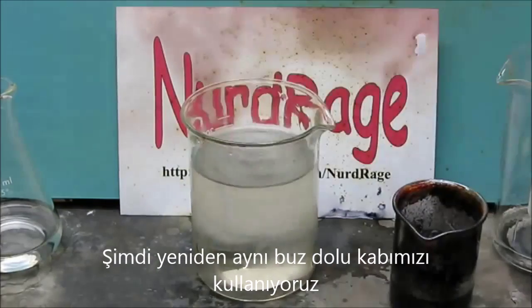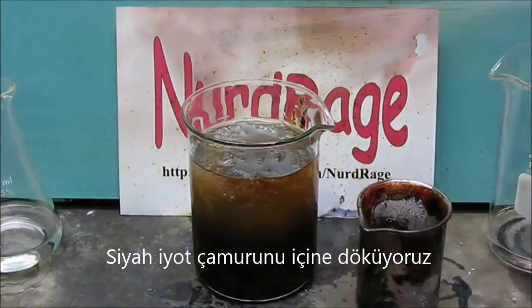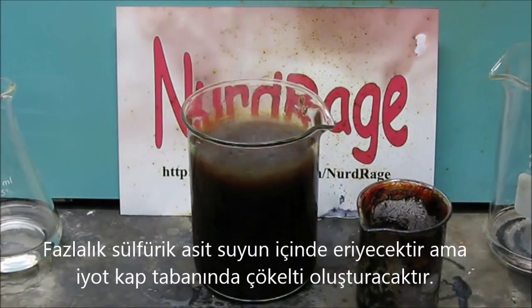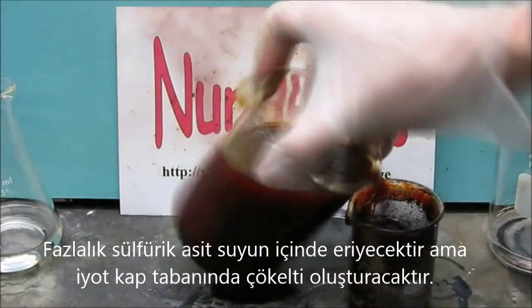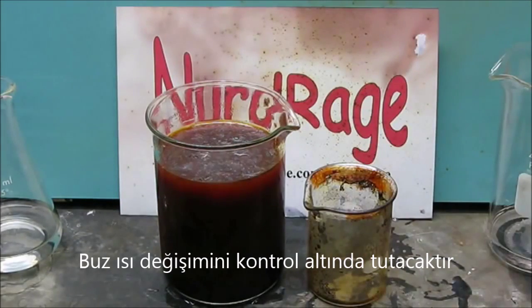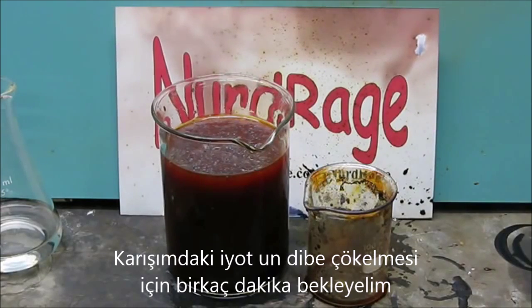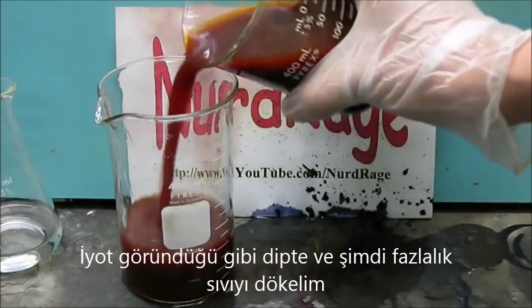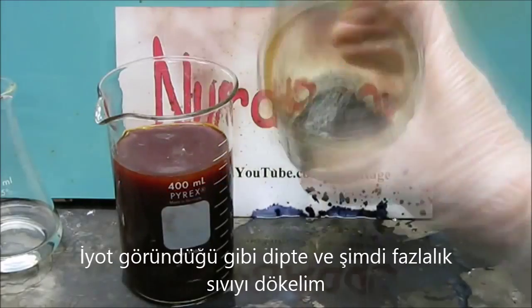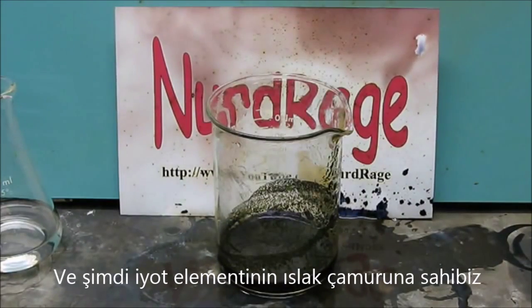Now using the same ice water bath, pour the black iodine slurry directly into it. The excess sulfuric acid will dissolve in the water, but the iodine will precipitate out. The ice is needed to keep the temperature rise under control. Let the mixture stand for several minutes to allow the iodine to settle out. The iodine is at the bottom, so simply pour off the excess liquid. And now we have a wet slurry of elemental iodine.